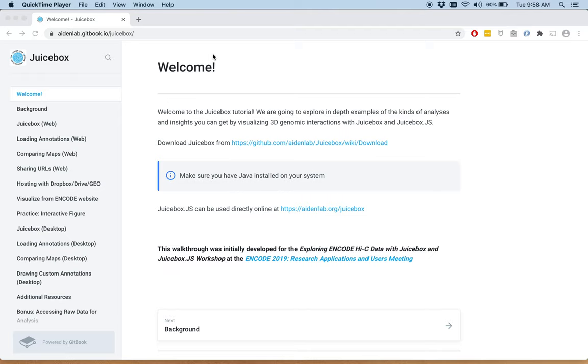Today we'll go through how to use JuiceBox on the web. So scroll down and open the link in another tab.